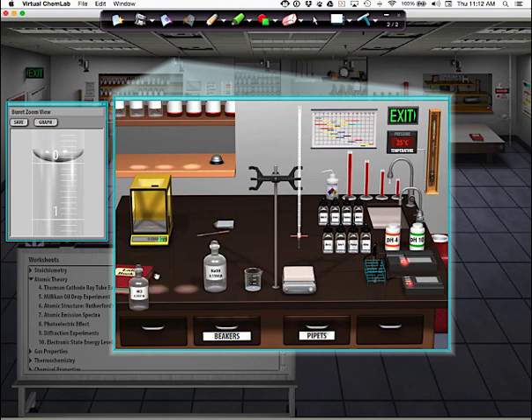So you're going to grab the HCl bottle and you're going to move it not to the 5, but to the 10. And again, you sneak up from below. But guys, you'll notice that it's not filling. It's taken the bottle from me, but it's not filling. What do you have to do to get it to fill? Let go. So next to this one, you want to write let go. And then it'll fill the graduated cylinder all the way to the top and then put it back. There we go. So now we have filled that graduated cylinder by letting go.